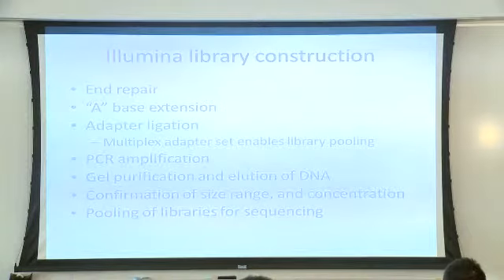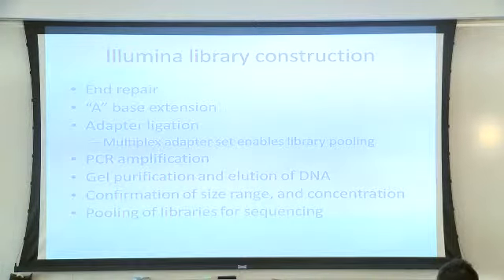One of the improvements that we'd like to make going forward is to get more reads of more distributed marks and fewer reads of less distributed marks, because really what we want to do is not have an equivalent number of reads for each immunoprecipitation, but rather to have an equivalent chance to discover the enriched regions that actually exist in a cell. And we know that we need more data to discover certain kinds of modifications than we do to discover other kinds, based on the fraction of the genome that is tied up in that particular modification.